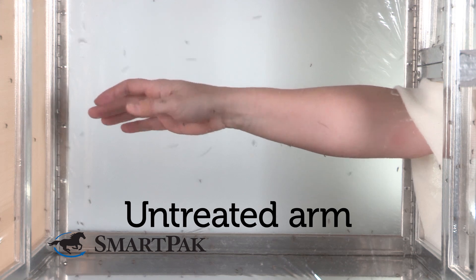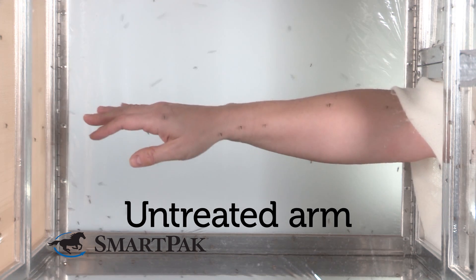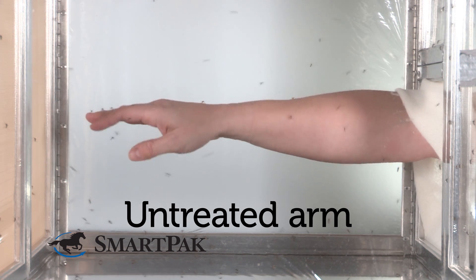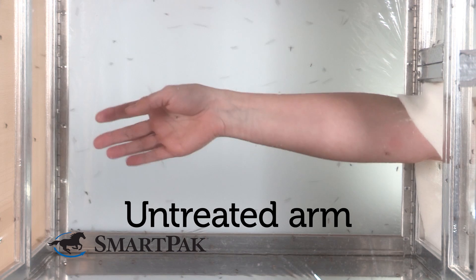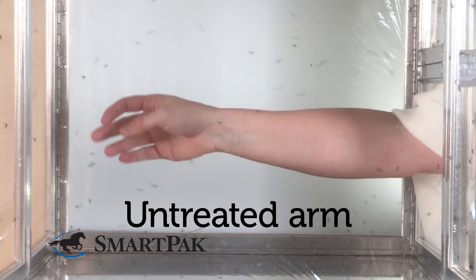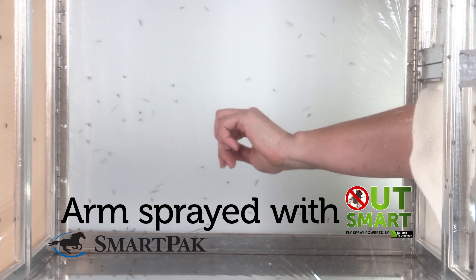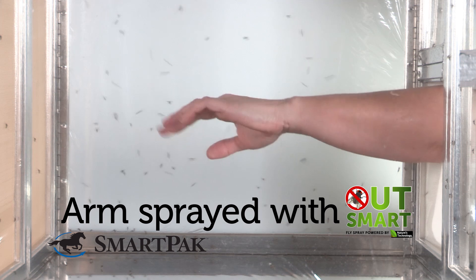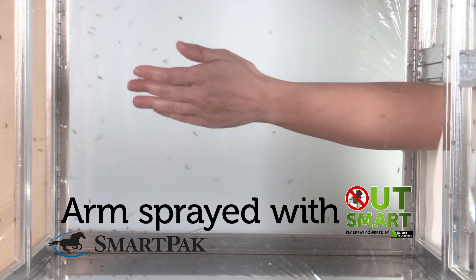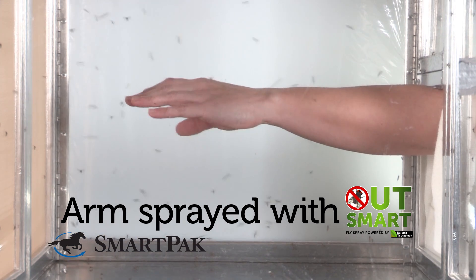What I'm seeing in this video, the mosquitoes are responding in typical behavior. When the arm is first introduced, it takes a moment for the mosquitoes to discover the arm. The mosquitoes are excited by the arm and stimulus being in the cage and responding with a feeding response. With the arm with Outsmart on the volunteer's skin, the mosquitoes are not responding to the volunteer's arm. No landings are being made and the mosquitoes are keeping a distance from the treated surface.